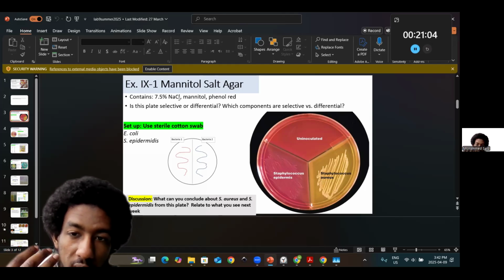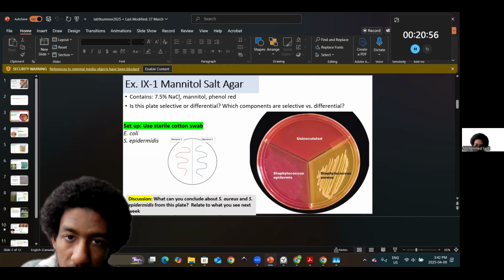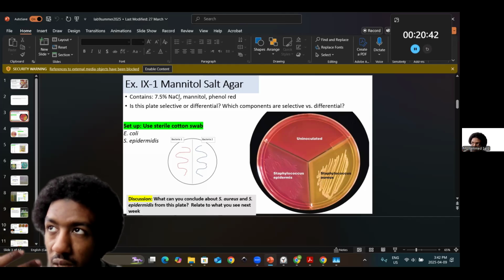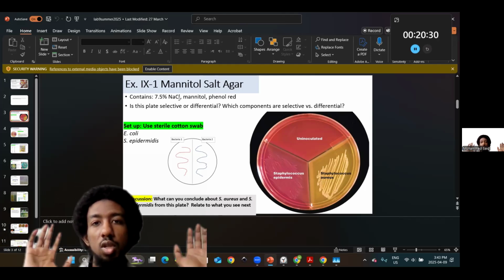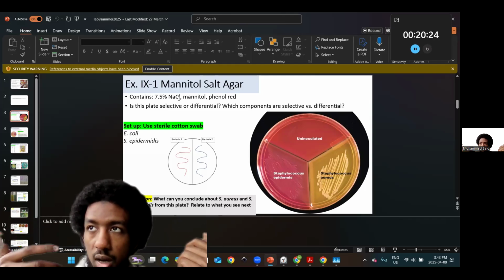But what I want to highlight is that this phenol red dye serves as a proxy. Because think about it for a moment. Mannitol is just differentiating bacteria that either ferment this sugar or not. If a bacteria doesn't metabolize mannitol, that doesn't necessarily mean it doesn't survive. It just doesn't metabolize or ferment it. In these plates itself, just like LB agar, a nutrient-rich medium, you expect there to be other nutrients that it can metabolize or grow on.